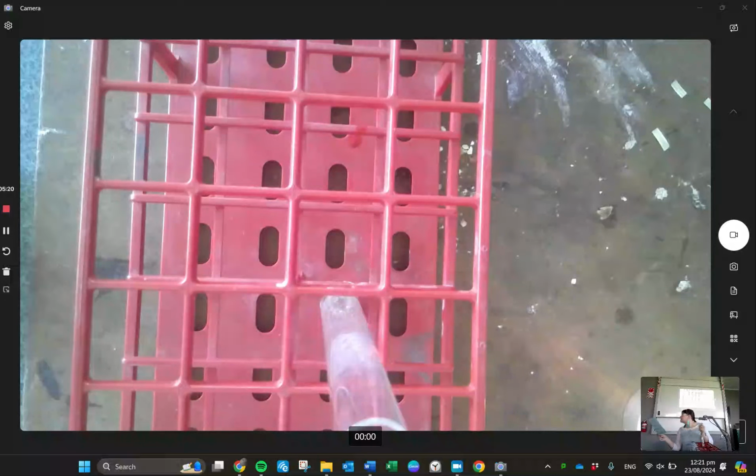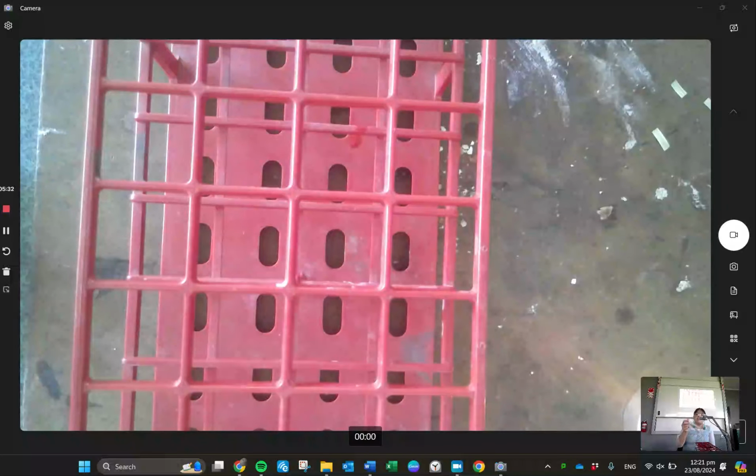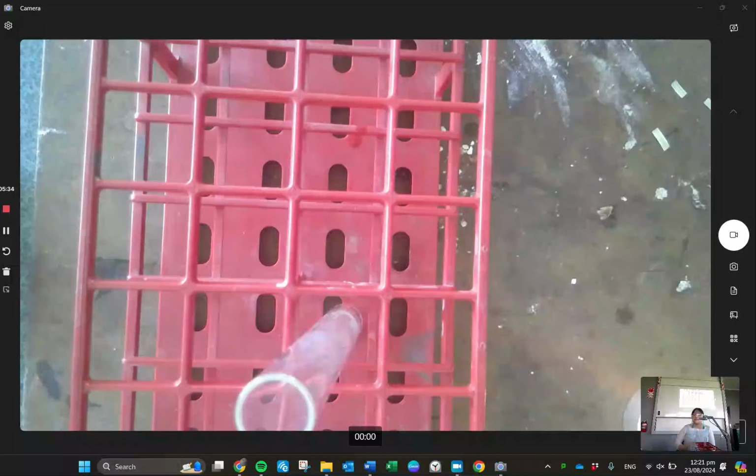They're probably somewhere. All right. So you guys are welcome to write that up. I'm happy if you guys want to do another pop test because it's fun. I can give you guys some more magnesium. Be mindful that you probably need a top up of the sulfuric acid.